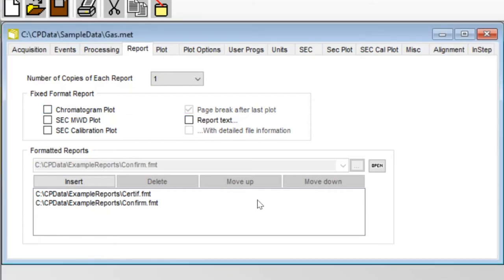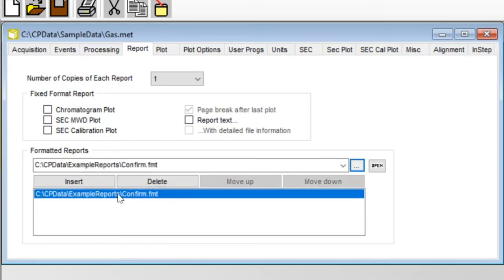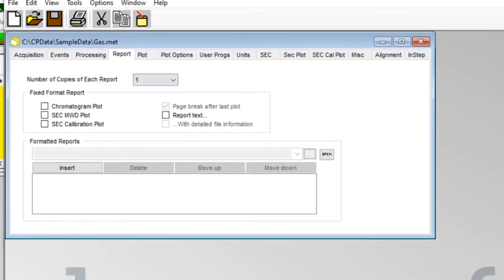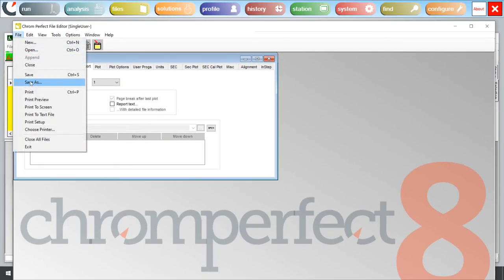To disable formatted reports, just delete any .fmt report template files which are listed in the dialog box. First, select the file name and then click the delete button. Next, save your method.